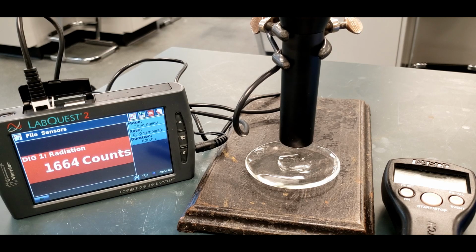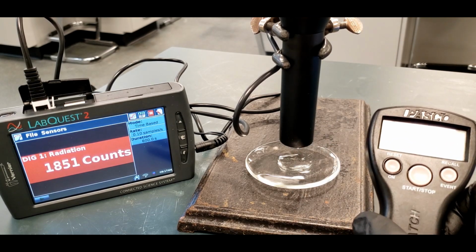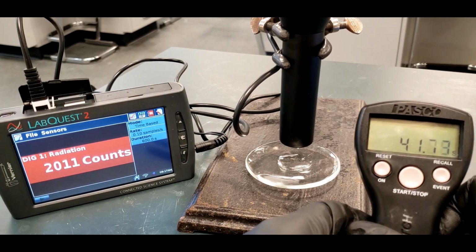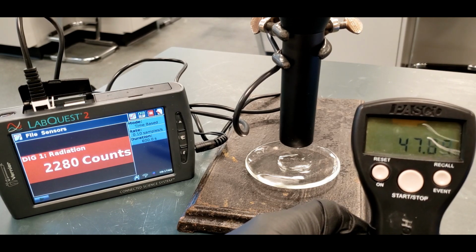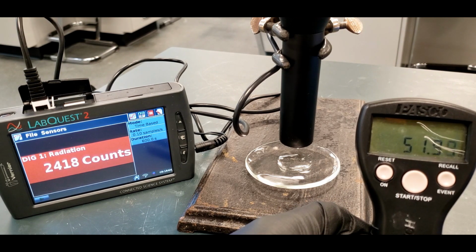Okay. Just wanted to get... And you can see that it's going to be an estimate when we get to 60, but that's fine. It works out really well. If I'm off by 20 or 30 counts out of thousands, not a big deal. Okay, so we'll just do the first 2 minutes, and after this first minute, I'm shutting that sound off. It's getting to be annoying.